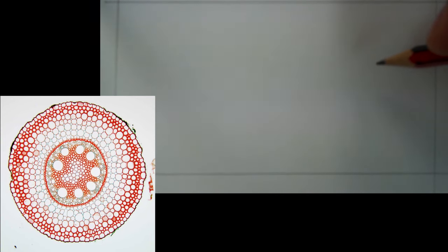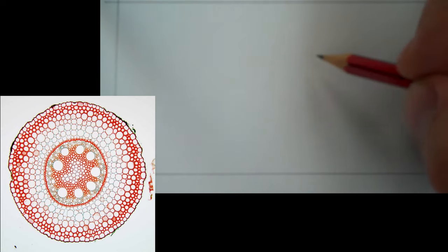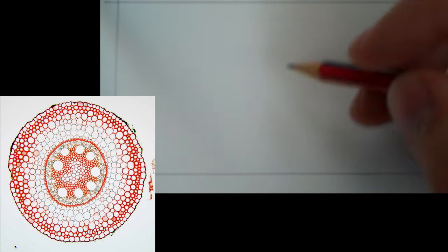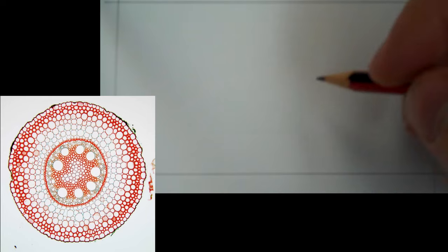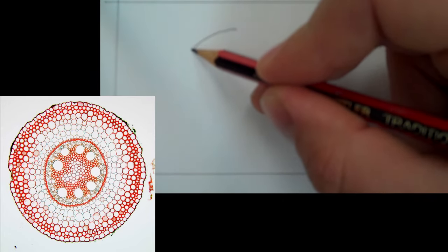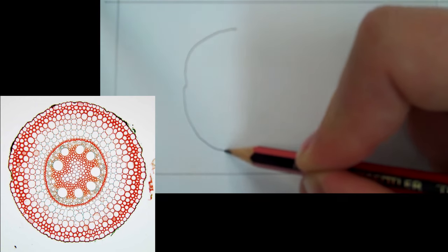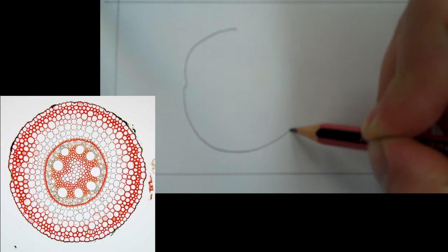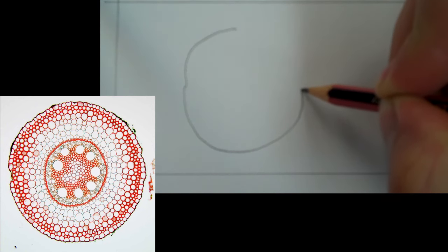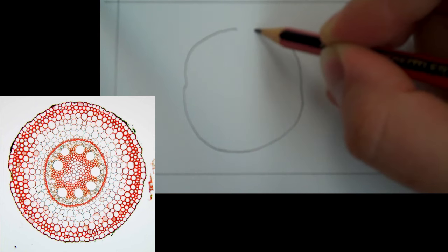So first off, we have got quite a circular structure, so I might start with drawing a circle. This makes planning the use of our space a lot easier, because once I've drawn that circle, everything else goes inside. So it's quite a nice one in that respect. So again, not taking my pencil off the page. My circle's a little bit square.